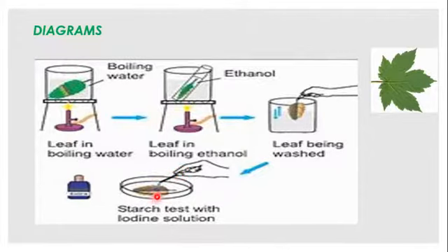So it's now released onto the leaf. There will be color change. So that will now mark the end of the experiment. So now let's go through the procedure step by step, and then see the observation, and then we conclude.